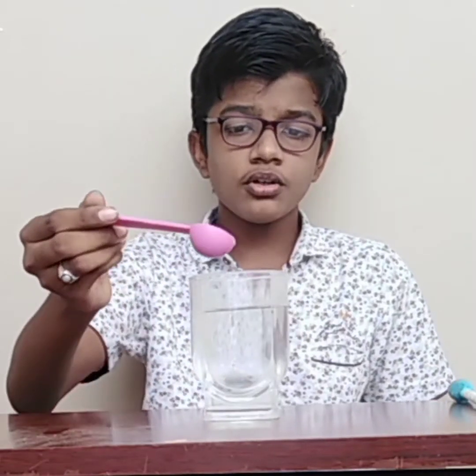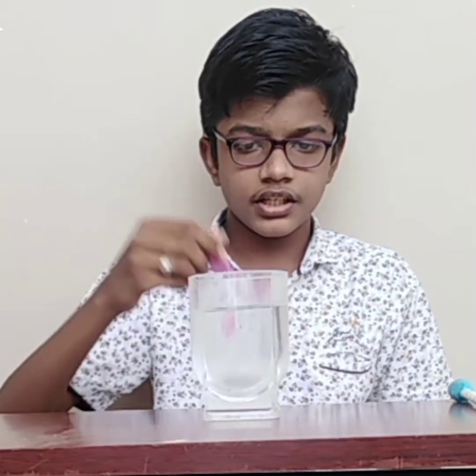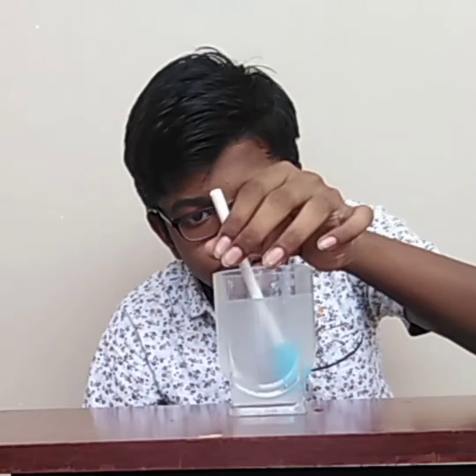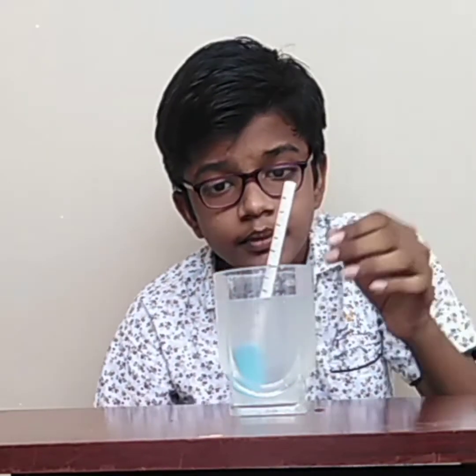Let us add salt to the container to increase its density. Now let us drop the hydrometer into the salt water. It floats higher in salt water, sinking only 2 centimeters below the surface.